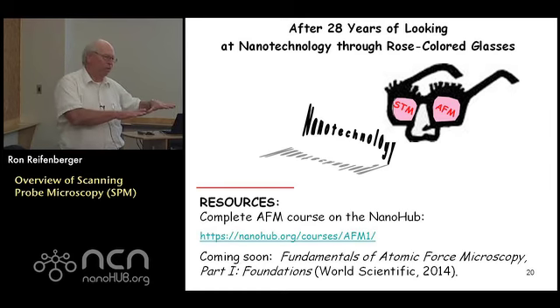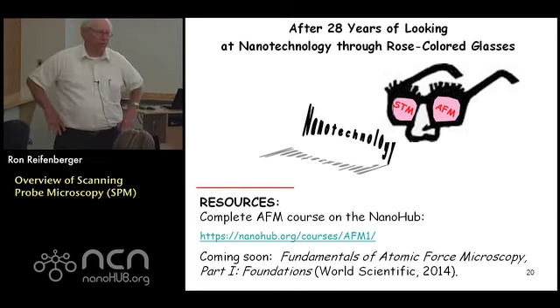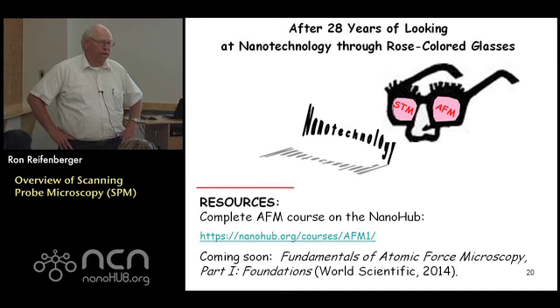Those of us that grew up with scanning probe microscopes were more comfortable with the scanning probe microscope compared to the scanning electron microscope. So we tend to use it, you know, so there's a lot of reasons. But I would say they still provide complementary information, right? Each has their own strong point, right?